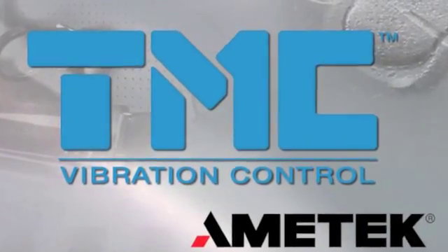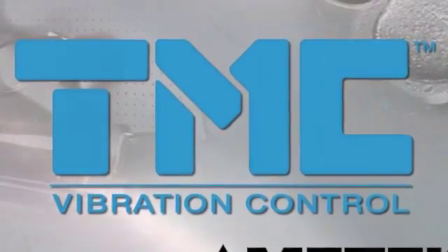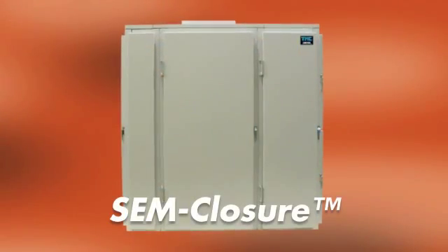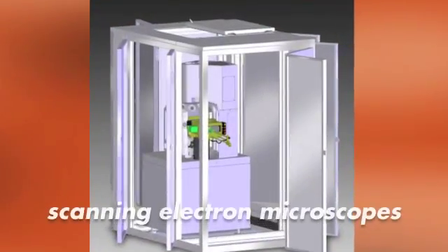TMC, a unit of Ametek Ultra Precision Technologies and a world leader in high performance vibration control, introduces SEMCLOSURE, an acoustic enclosure designed specifically for scanning electron microscopes.